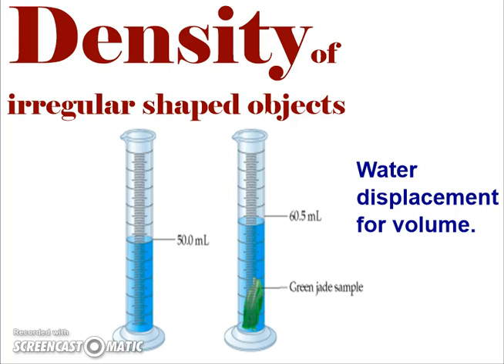Okay, just a little reminder on what you know about water displacement. We would use water displacement to find the volume. Here you take a reading of a graduated cylinder. Lots of times students like to fill right up to a certain line so it's easier to subtract and so they make sure they're reading it right. I don't care. I just pour in an amount of water so I know I can still fit whatever object I'm going to measure.